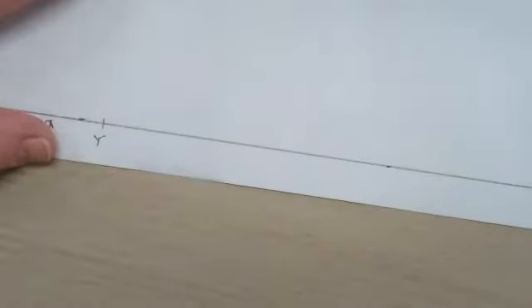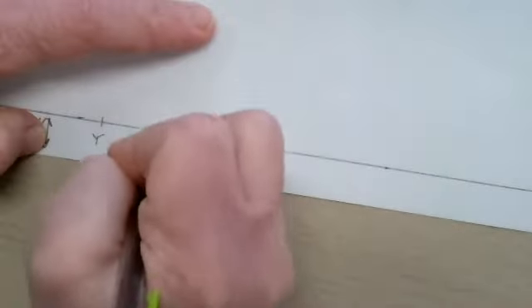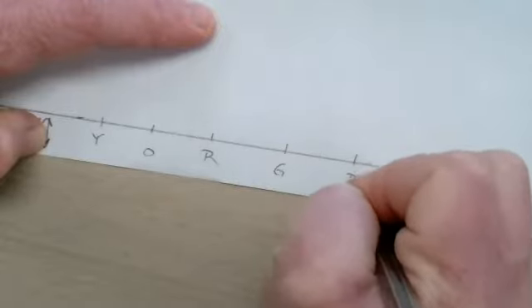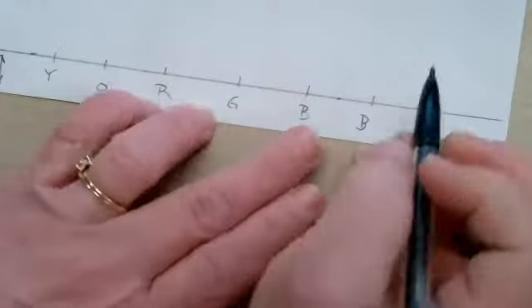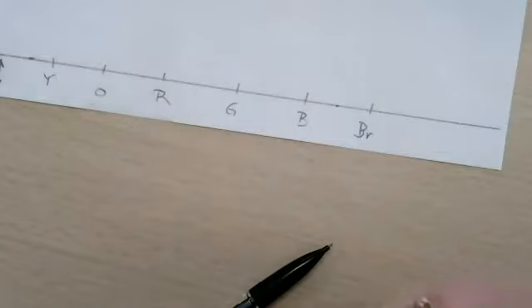And let's say I'm going to put my yellow. So I'm just going to use a Y to be yellow. Feel free to write yellow. Feel free to number it just so that you remember, oh, that was the yellow. And then we have the orange and then red, green, blue. Oh, I probably don't want to use B for blue and brown. So just designate them differently.